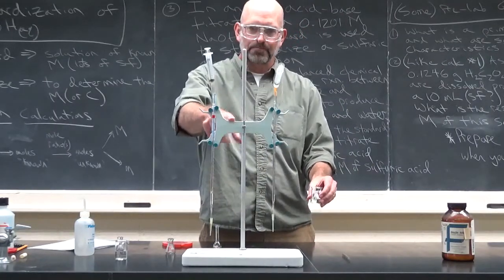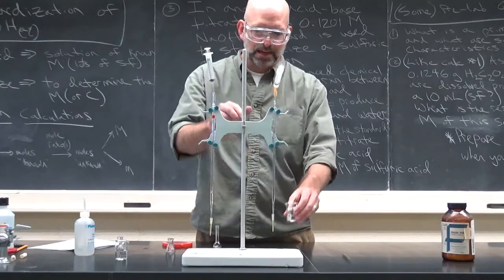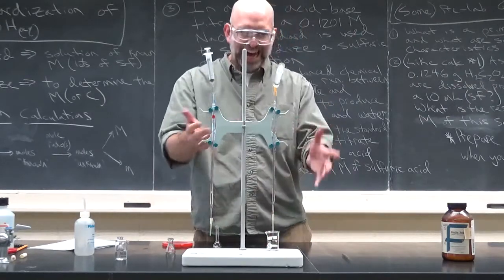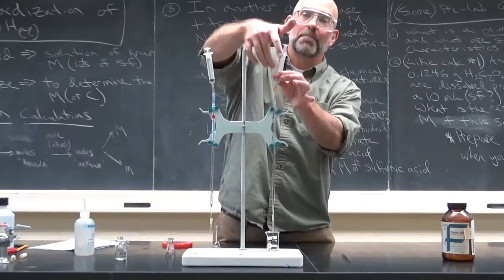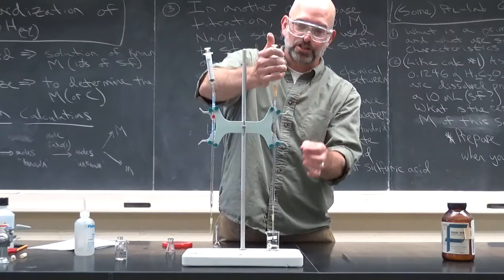Everything is clear and colorless. It's really easy to lose track of what's what. Okay, so you want to put some liquid in this. There's already some in here, so it's pretty straightforward. Oh, this is a burette clamp. Okay, make sure that's on there tightly. And you may have to adjust the height. And the syringe, by the way, is used just to draw the liquid up.